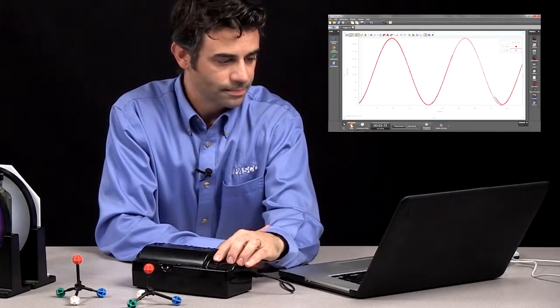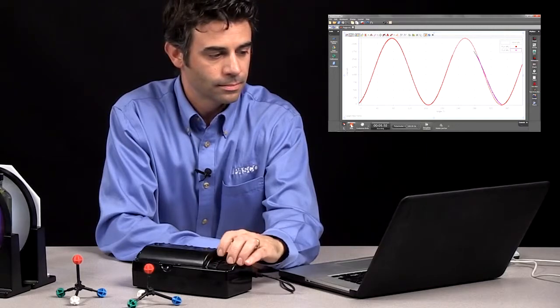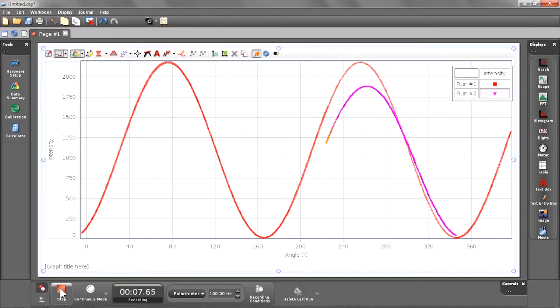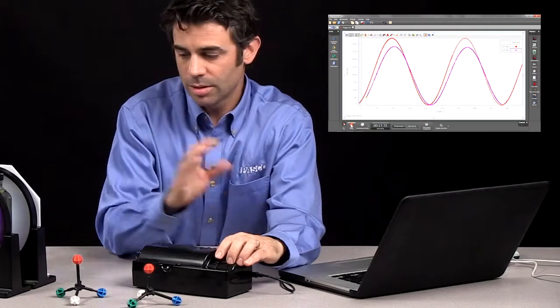And again, I'm just going to spin the wheel. There we go. Notice the intensity is a little different. And that makes sense. There's something in there. But also notice that the peak intensity is shifted slightly from where it was before.